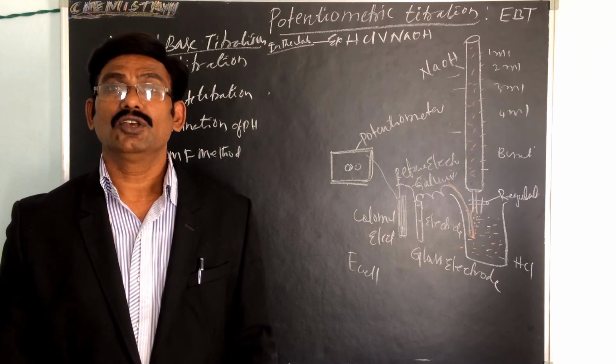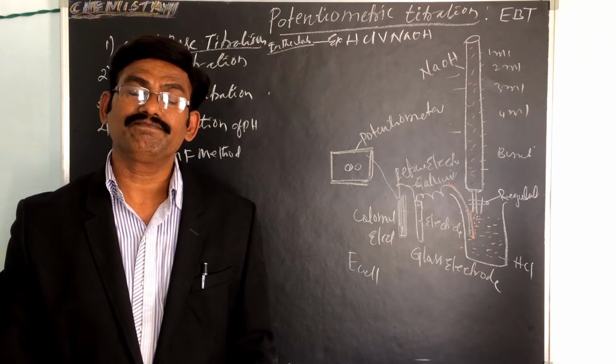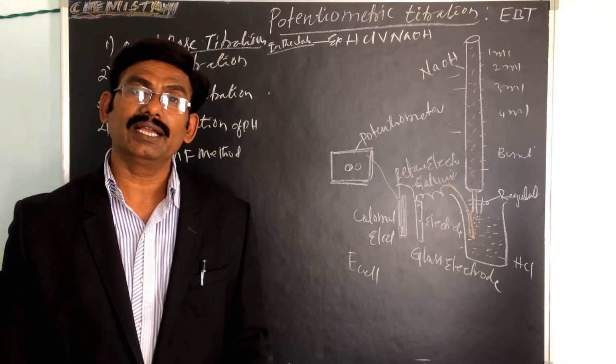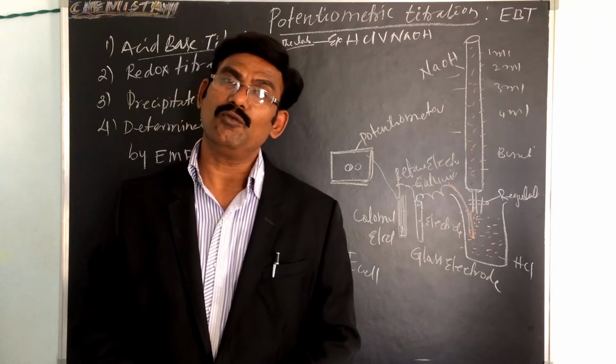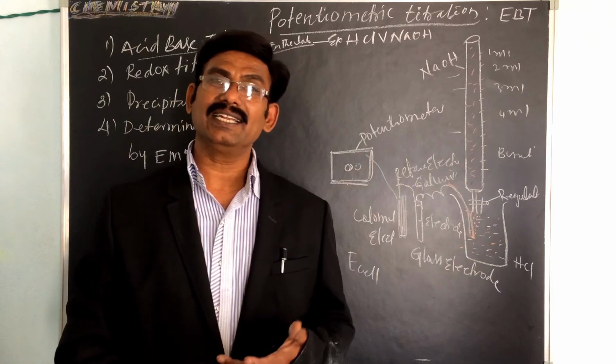The EMF goes on decreasing as the H+ ion concentration decreases. So what reaction takes place?